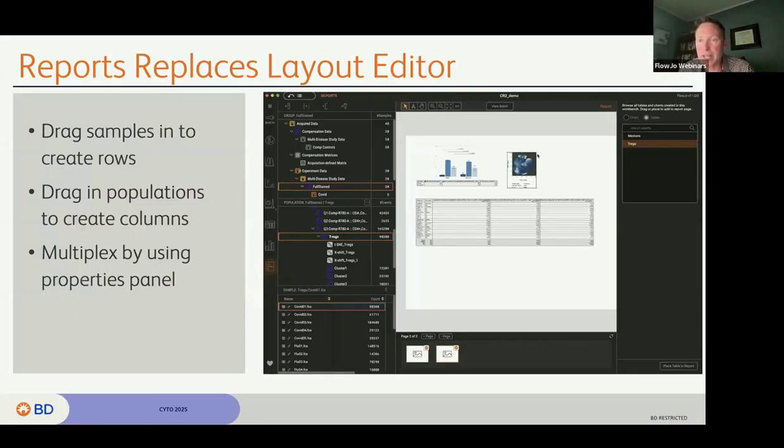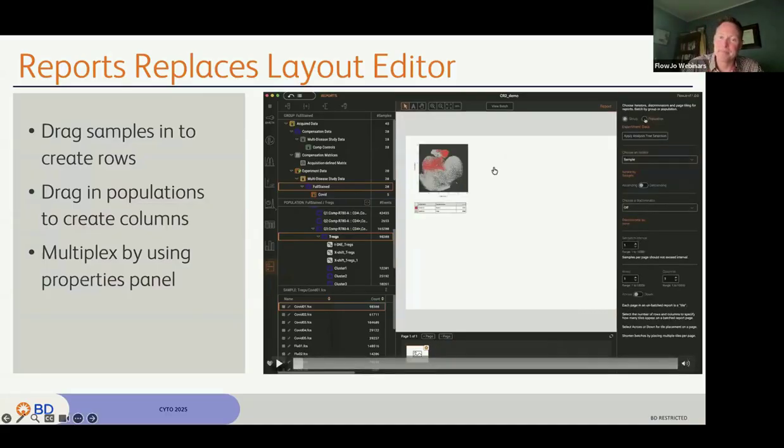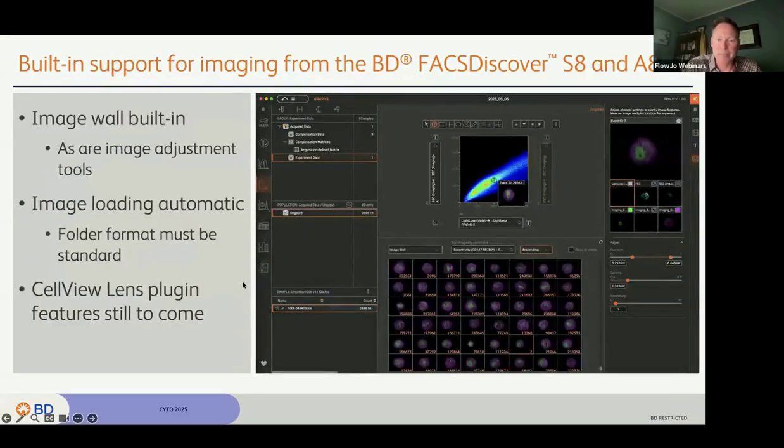It's just how you want it at the moment, and there's a save as button that breaks off a report, fixes it essentially. If you're happy with the way that one works and you want to start building other variations, you can do so. So I think this simplifies the whole process of building reports. You can let me know. Okay, and on to the next slide.